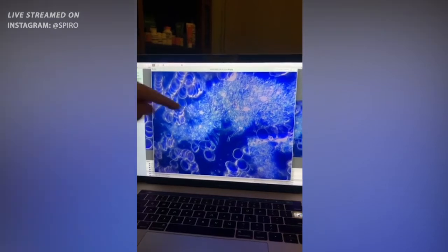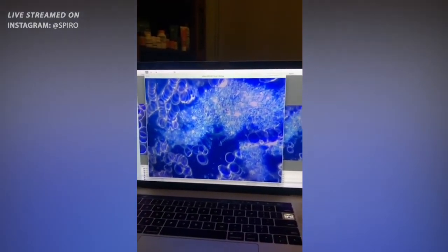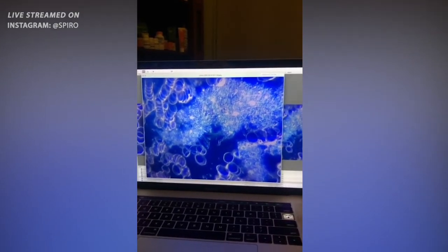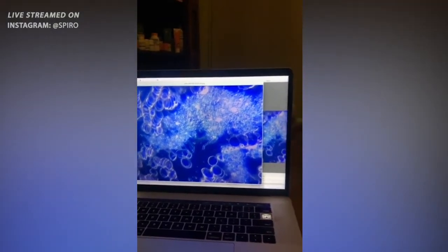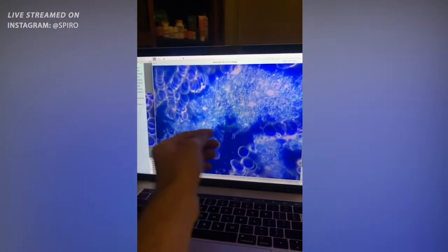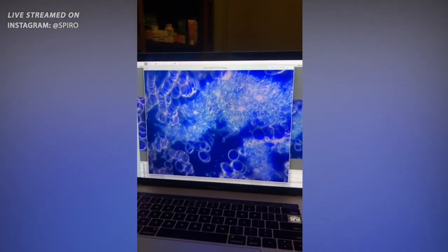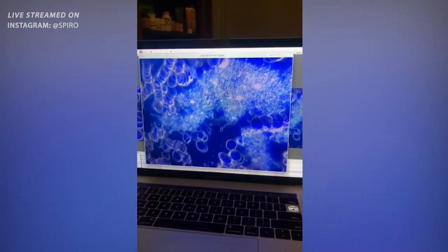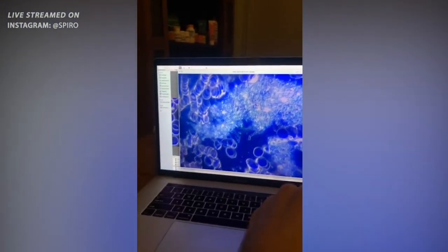This is like a crystallized, unknown structure that looks like it has a life of its own, that's growing a network. That's what it looks like to me. It looks like a crystallized graphene structure that is growing a network, and you can see these Morgellons-type strings sticking out of it. This is very, very bizarre. And Dr. Peggy has never seen anything like this in 30 years of practicing medicine. That to me is really bizarre.